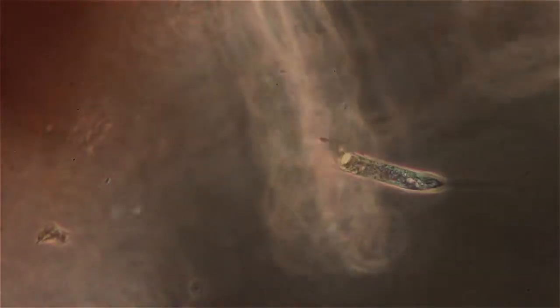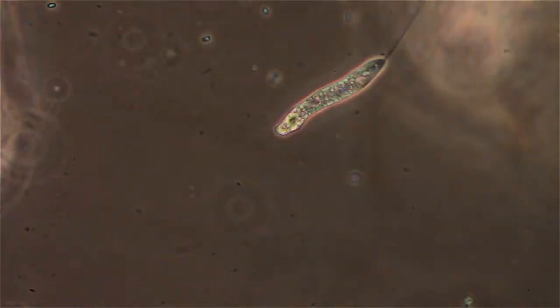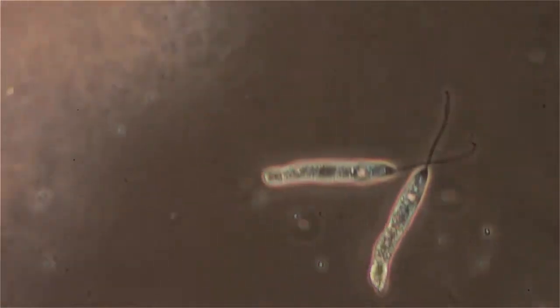There's colony after colony of bdelloid-type rotifer and packs of peronema swimming around.